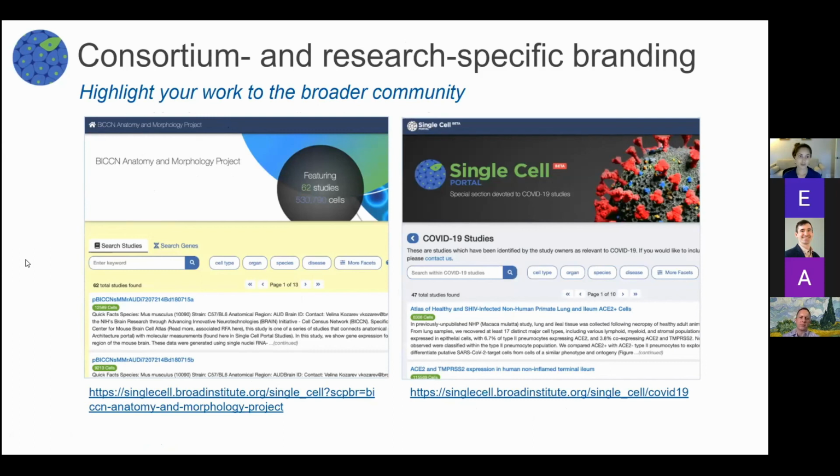All of these studies are also available on the wider SCP, but it just allows you to search through a subset that might be particularly useful for people that you collaborate with or with whom you want to share your work. We have another collection for COVID studies that were recently released.